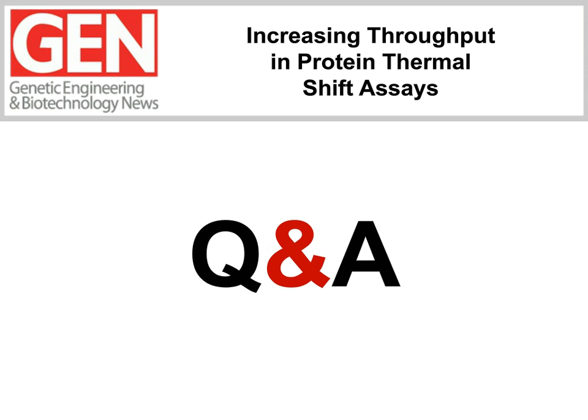So someone would like to know, can biomagnetic beads or particles bound to the proteins be used in thermal shift assays? It's a very, very interesting approach. It actually crossed my thought process when I was looking at the magnetic class particles in terms of interactions. But we haven't tested it. Given a chance, I would definitely want to test those things. But we don't have a particular experience that I can comment on.